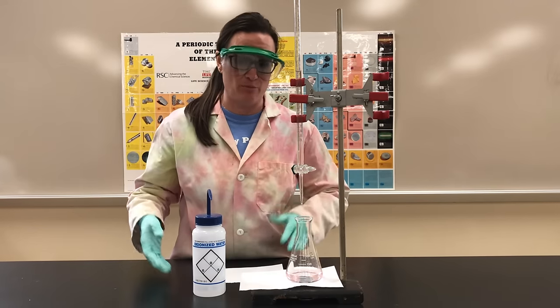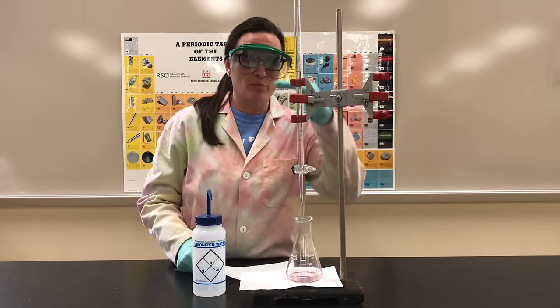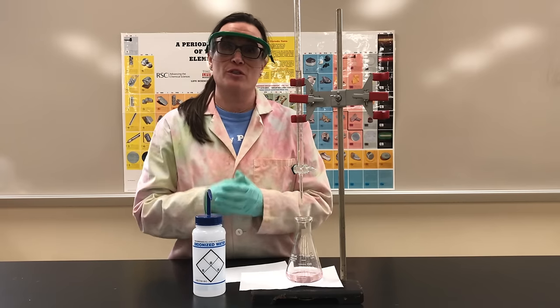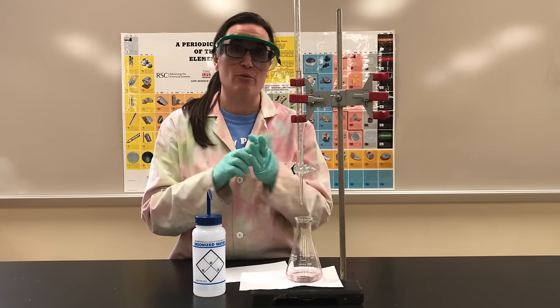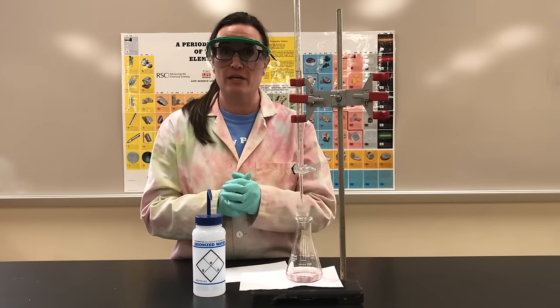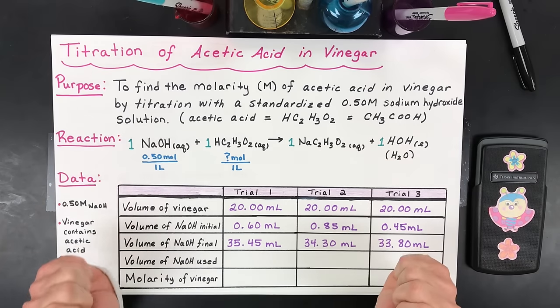So the last step before you start to clean up is to take a piece of white paper, put it behind that burette, and read the burette at eye level, and record that volume in your data table with two decimal places and milliliters as the unit. Two decimal places, for example, means maybe I would record 35.45 milliliters in my data table as my final volume. All right, on to the titration calculation portion of this video.